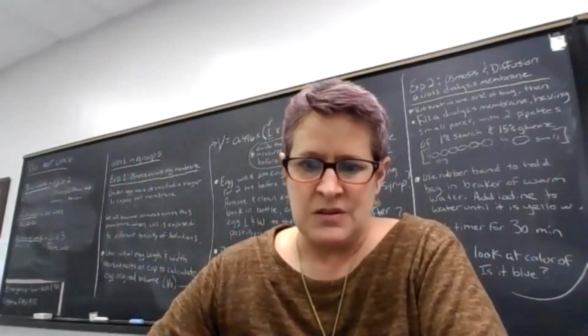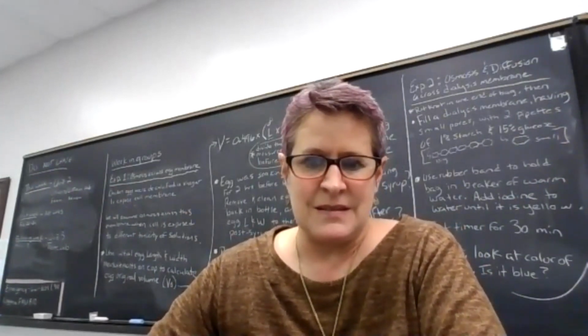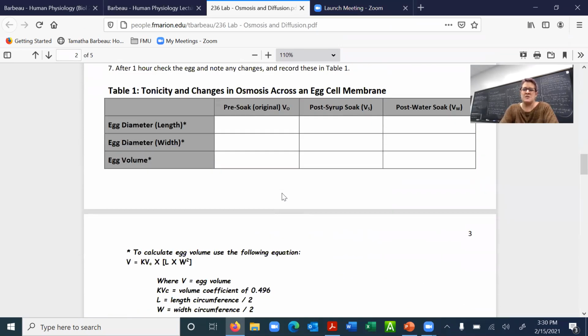I'm going to share the screen with you. Here we go. So what we're doing first is looking at osmosis across an egg cell membrane.